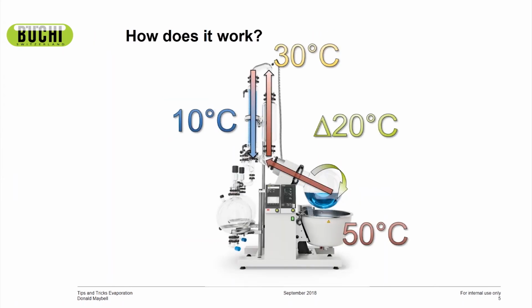This is just to show you that the same applies to the industrial scale as well. If you're using this to recycle a lot of solvents from a lot of different laboratories, you can easily do the same thing on an industrial unit so that you get nice, good, efficient collection of the solvent that you're trying to collect so that you can reuse it down the road.